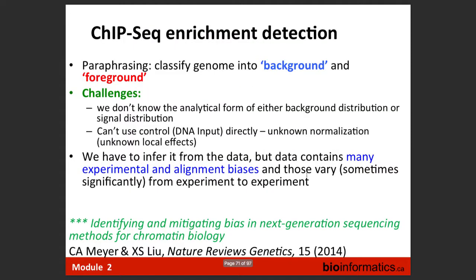Let me skip this. What are the challenges? So we used our input, we removed alignment artifacts. What are the next challenges? The next challenge, as I said, is to find enriched regions. Can we use input as our background? A question to you, and I ask it myself.